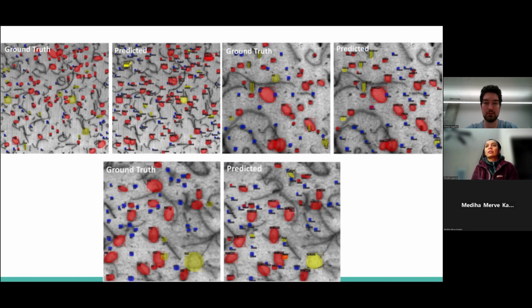If you were to automate a grain boundary analysis, I think it might be useful in the sense that a bounding box gives you a more general position of a defect, whereas a mask is very precise. So if you have an image that's slightly shifted because it's taken under a different g orientation, and the mask is off, it might throw off its ability to track one dislocation to another. That'd be a guess for me. I don't know of other applications where you might want a bounding box.